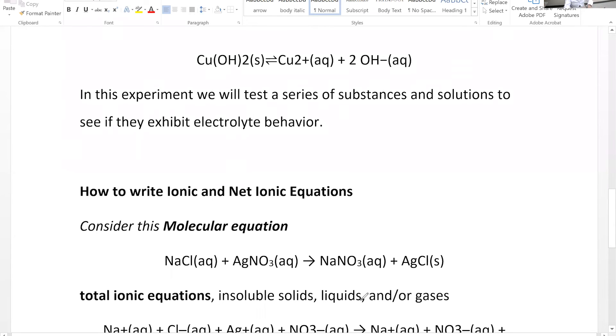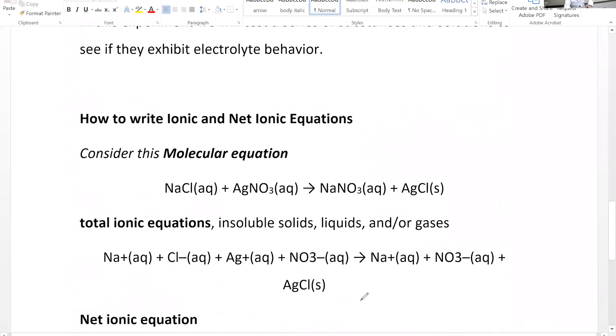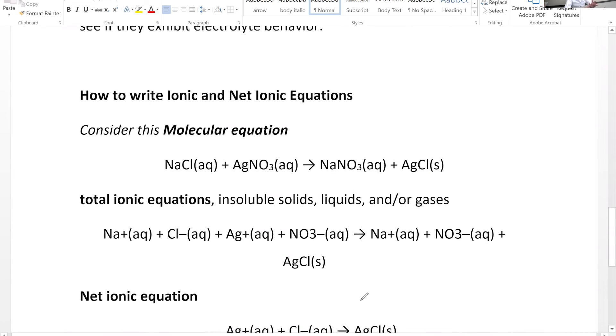So in this experiment, we are going to test few substances and those substances, they are listed in the lab manual. Also, the experiment is done for you to record. Part of the question in the pre-lab is asking for you to write the molecular equation and the ionic equation.